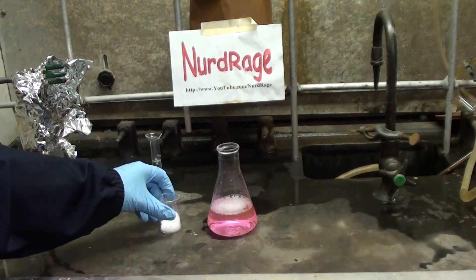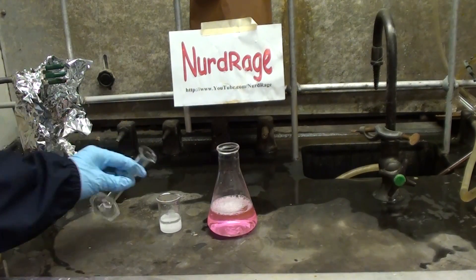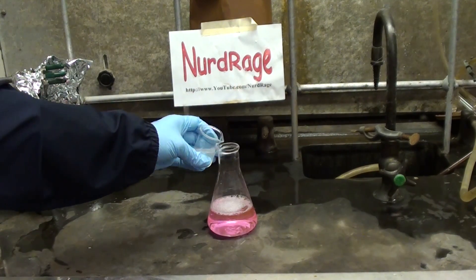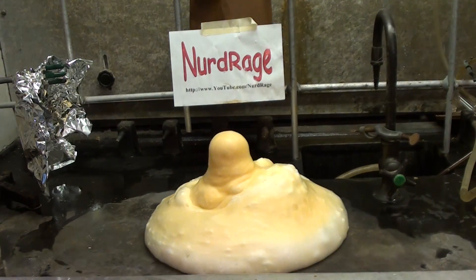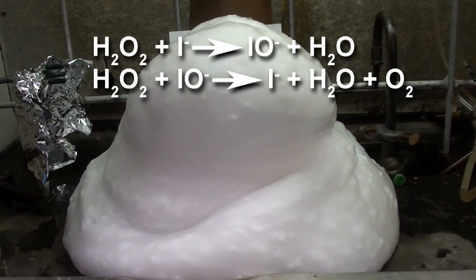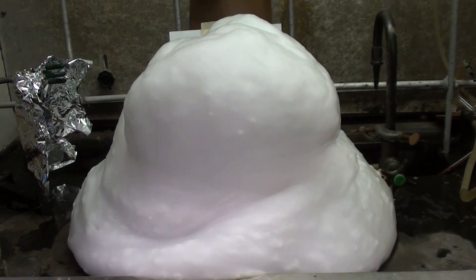Now we make a solution of potassium iodide by adding 10mL of water to 10g of potassium iodide and mixing it up. When you're ready, just dump the iodide solution in and stand back. And that is elephant toothpaste. What's happening is the iodide ions react with hydrogen peroxide in a catalytic cycle to generate oxygen. The reaction is really fast and generates a massive foam because of the detergent.